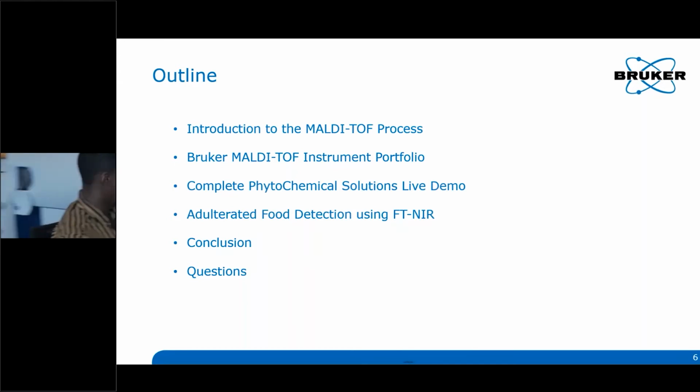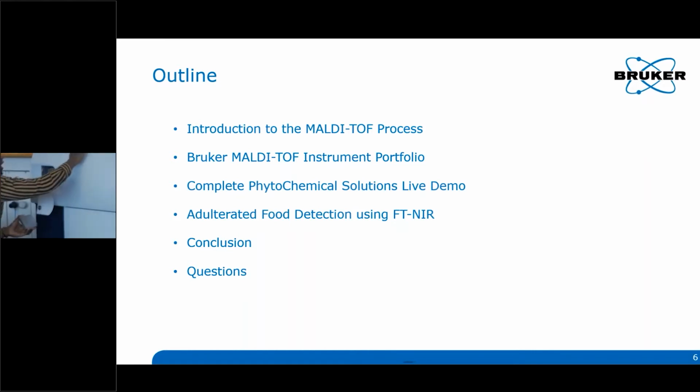So basically, once you have prepared your samples and you're ready to get started, all you have to do is click load and eject the plate that was in there. Open this inject window, insert it in, close the outlet, and then click load to load your sample. It takes a few minutes to get the pressures and everything in a vacuum inside of the ion source where it's supposed to be. And in about 30 seconds, you're ready to go and get started with your analysis.